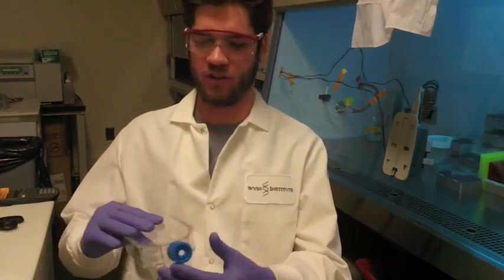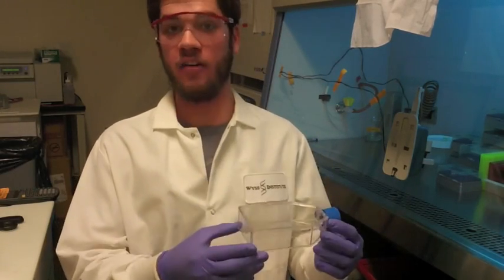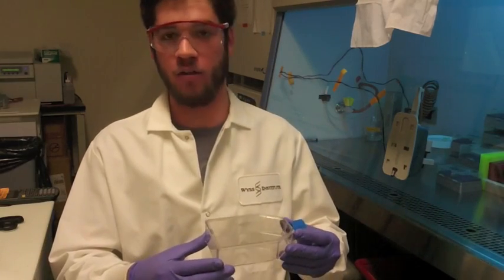So for my final project, I decided to pick one particular problem within this set of problems and see if I could come up with a way to do it better. So the issue that I decided to focus on specifically is one of keeping cells alive. If you want to study a line of cells, you need to have those cells. You need them to be alive and healthy.